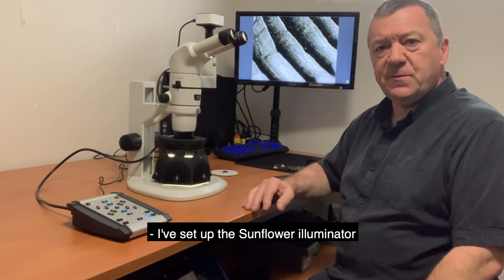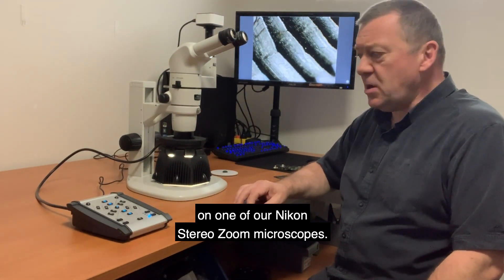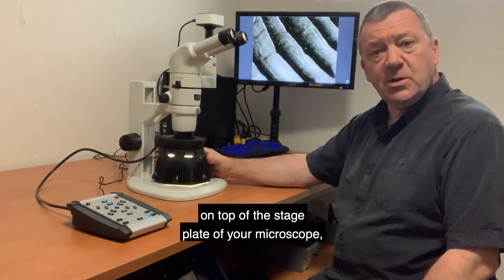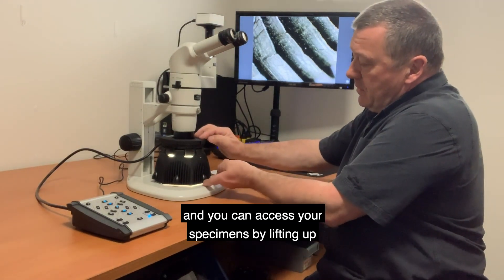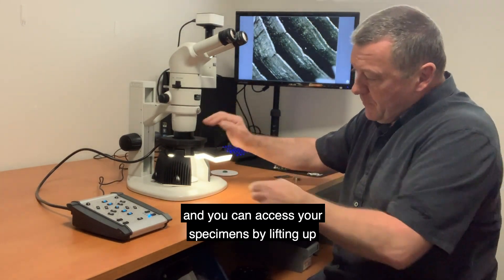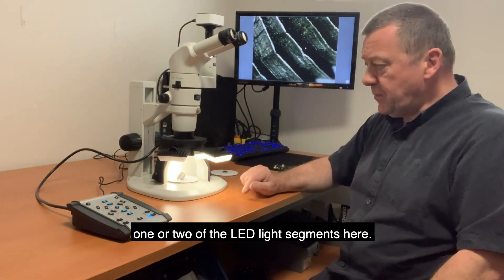I've set up the Sunflower illuminator on one of our Nikon Stereo Zoom microscopes. This is simply placed on top of the stage plate of your microscope, and you can access your specimens by lifting up one or two of the LED light segments.